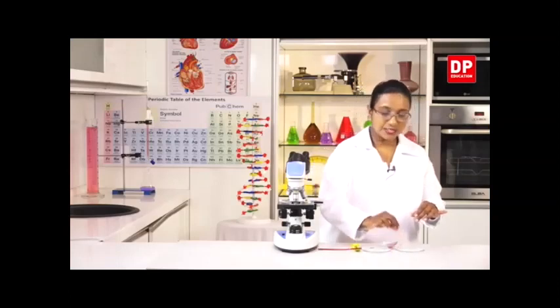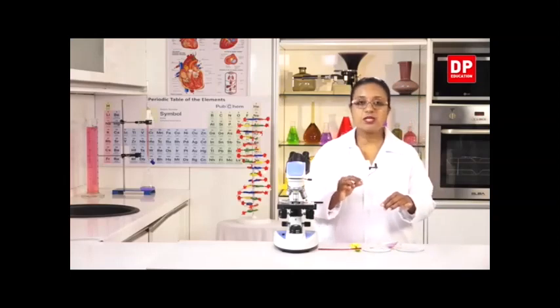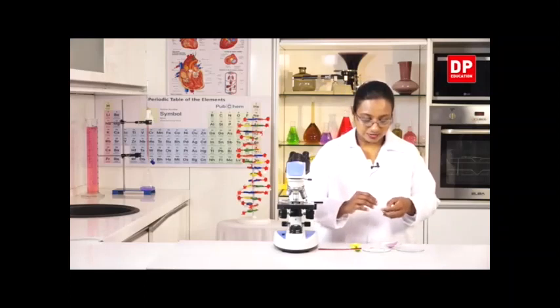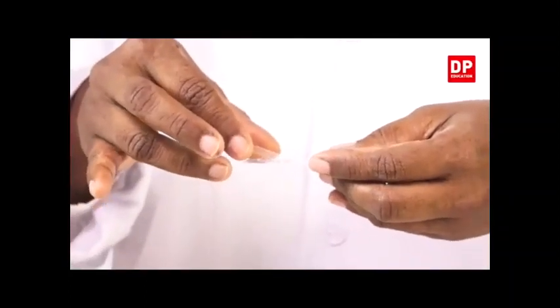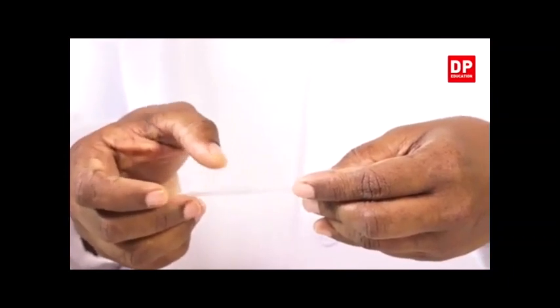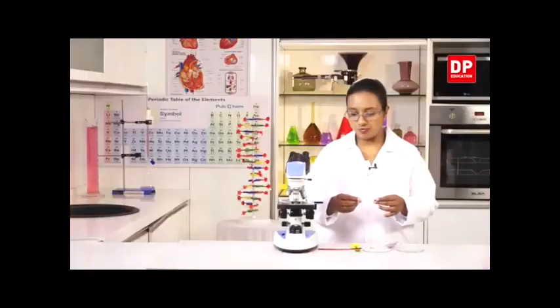Then I will take this cover slip. As you already know, we can't just put it on the specimen, as air bubbles can get trapped. Because of that, I hold the glass slide straight and the cover slip at an angle to the specimen and slowly place it on top of the sample. So now I have my glass slide ready to observe.